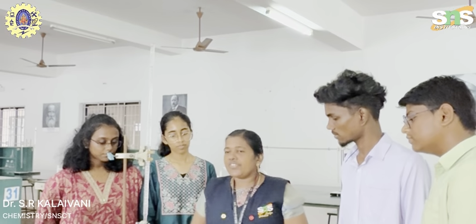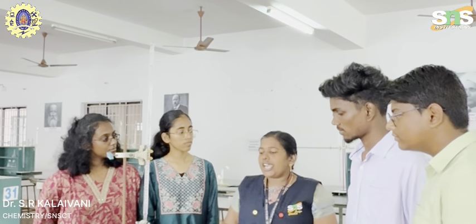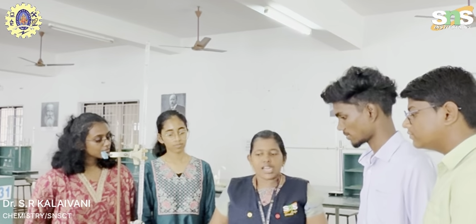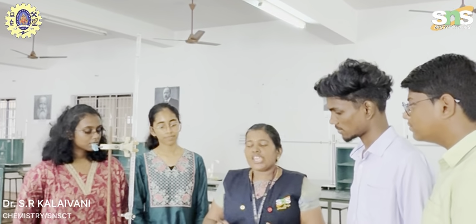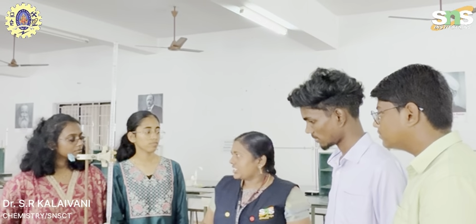In this experiment, we are doing 3 titrations. The main aim of the first titration is standardization of EDTA. The second titration is estimation of total hardness. The third titration is estimation of permanent hardness. So we can automatically calculate the amount of temporary hardness present in our water sample.